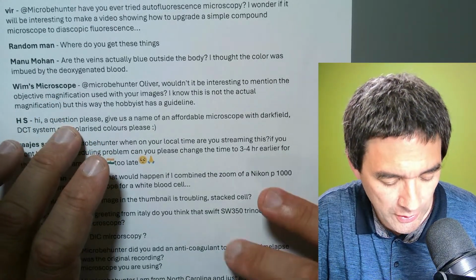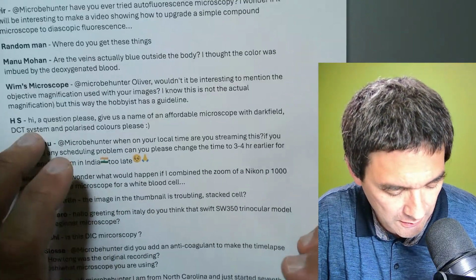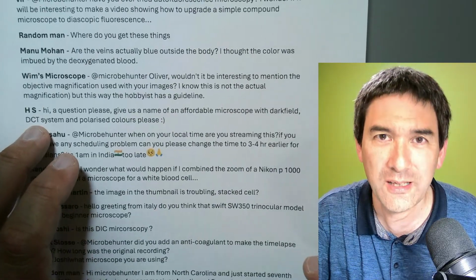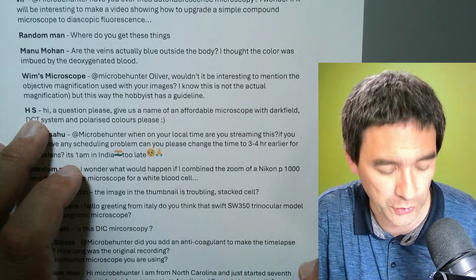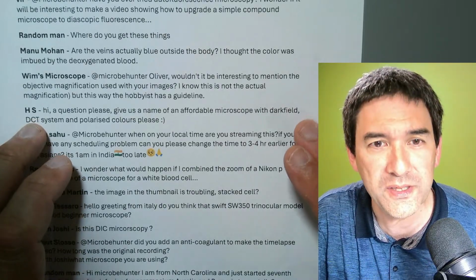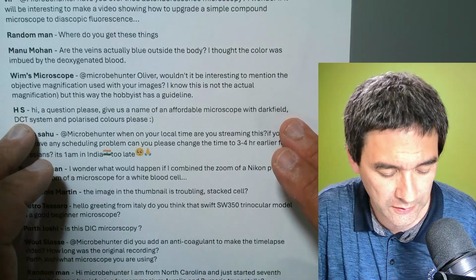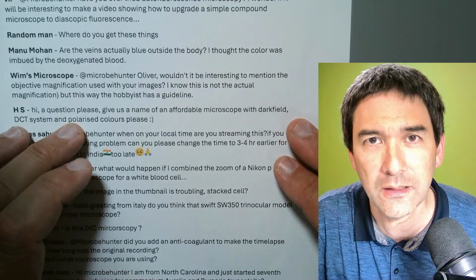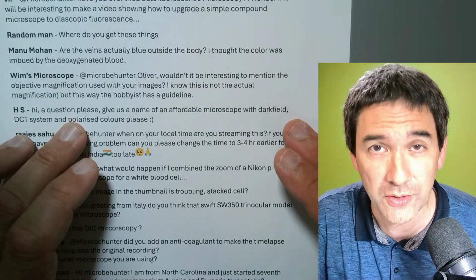A question, please. Give us the name of an affordable microscope with dark field. I suppose you mean DIC system and polarized colors, please. Affordable. As soon as you go to DIC, it's probably not affordable anymore. So I would say that many hobbyist microscopes that are out there with a condenser, you can easily convert to dark field. You can also easily convert it to polarized by adding two polarization filters. There are do-it-yourself adaptations that you can do.